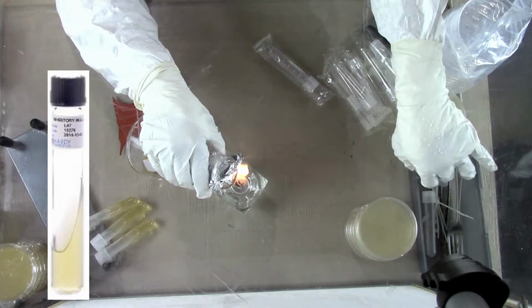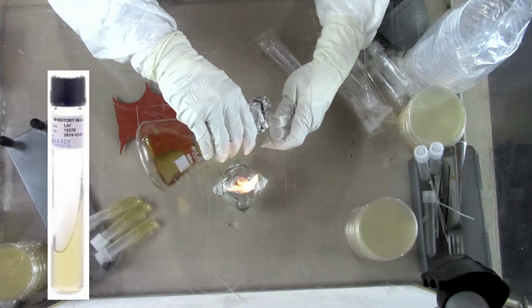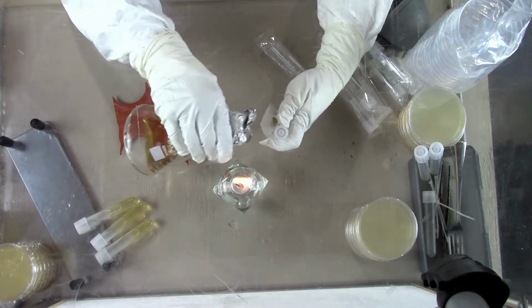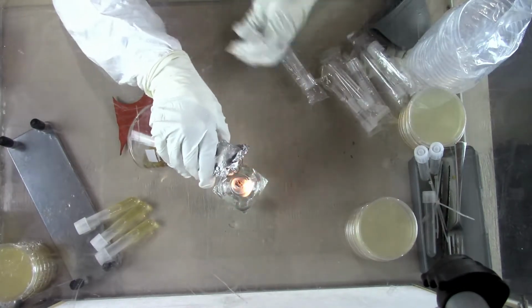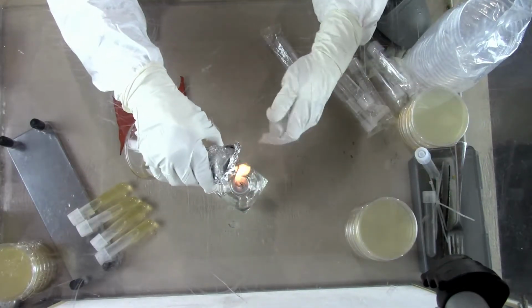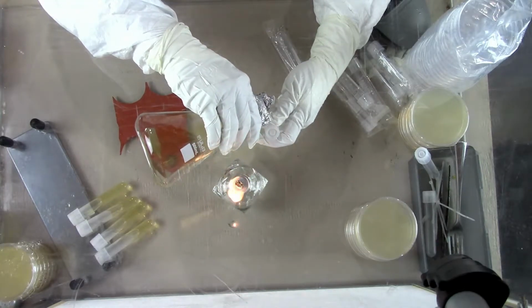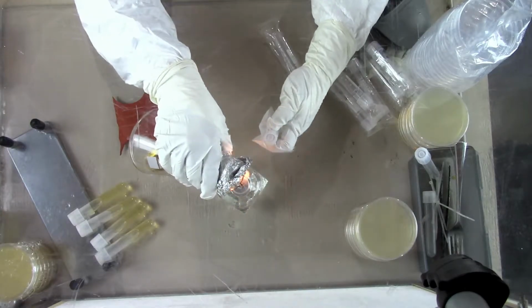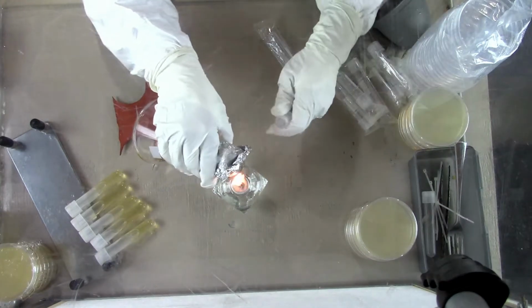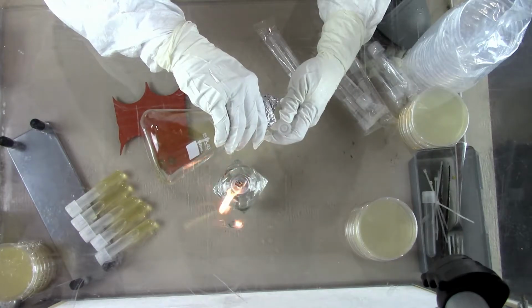Now, I always get the question, why would you do something in plates versus tubes? Remember, in plates we use 20 to 25 mils of agar, and there's a big space where we can do streak plates, or we can have multiple bacteria in there to pick. Normally we use tubes just for pure cultures, since we know what specific bacteria or microorganism we have in that tube. We use it for pure culture because it's a small area for the microorganism to grow, and at the same time we use less material. We would use 5 to 6 mils per tube.